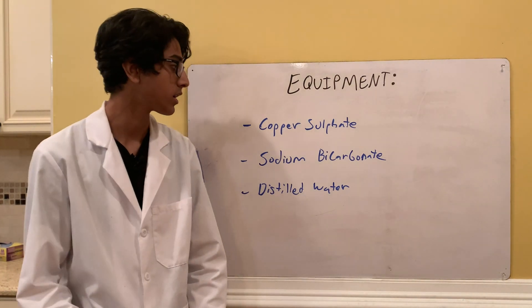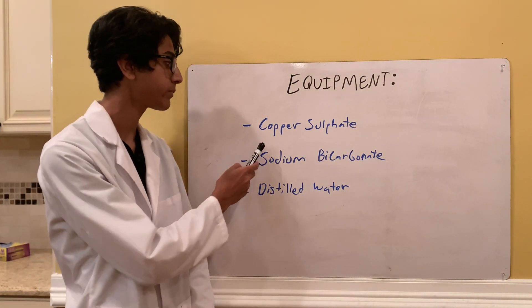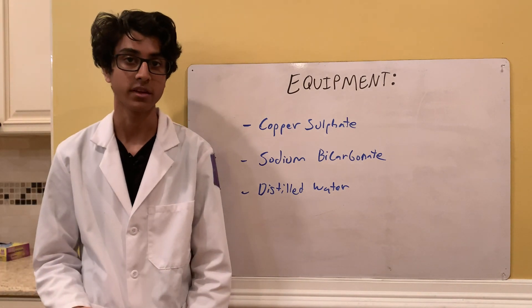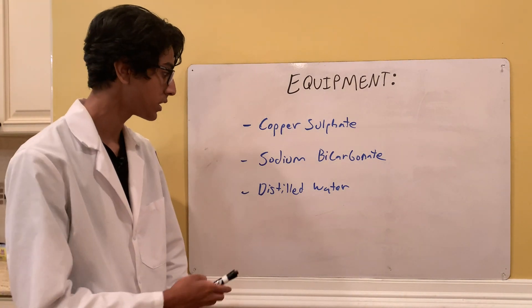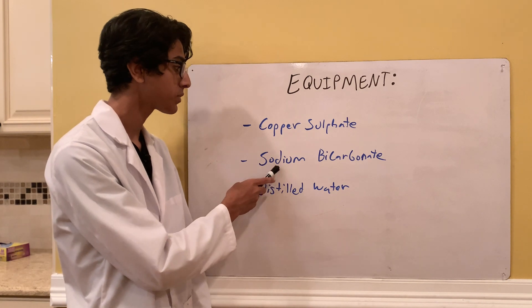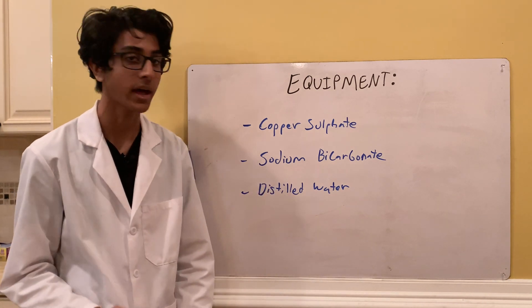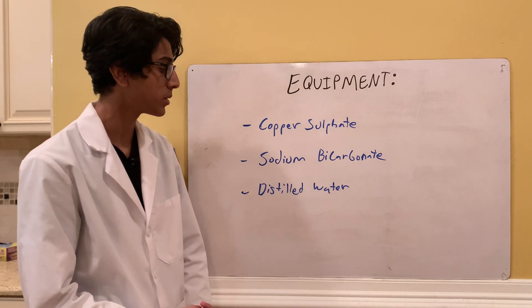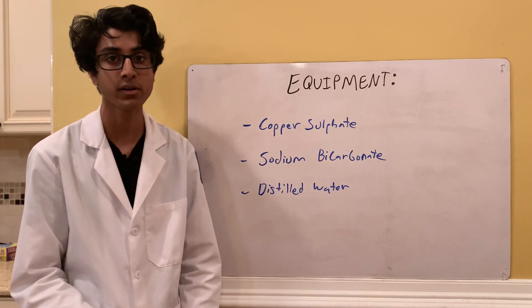The equipment for this experiment includes some copper sulfate, which you can just buy as a fungicide or make it yourself — it's pretty easy to make. And sodium bicarbonate, which you can find in your kitchen as baking soda, and some distilled water since it's going to be more pure than tap water, and preferably this should be warm.